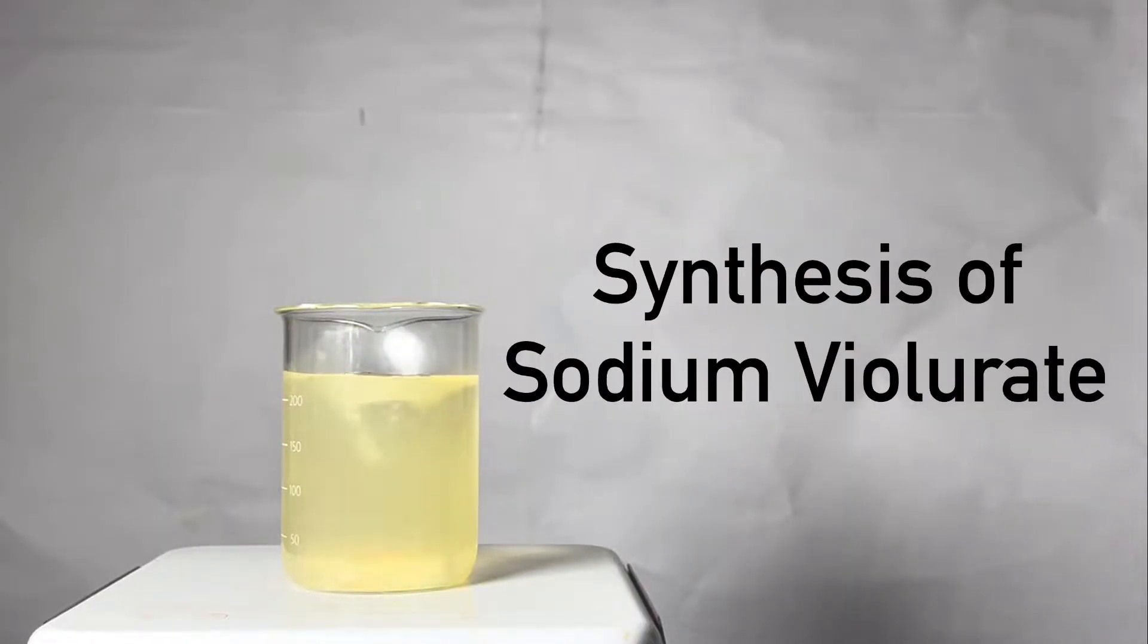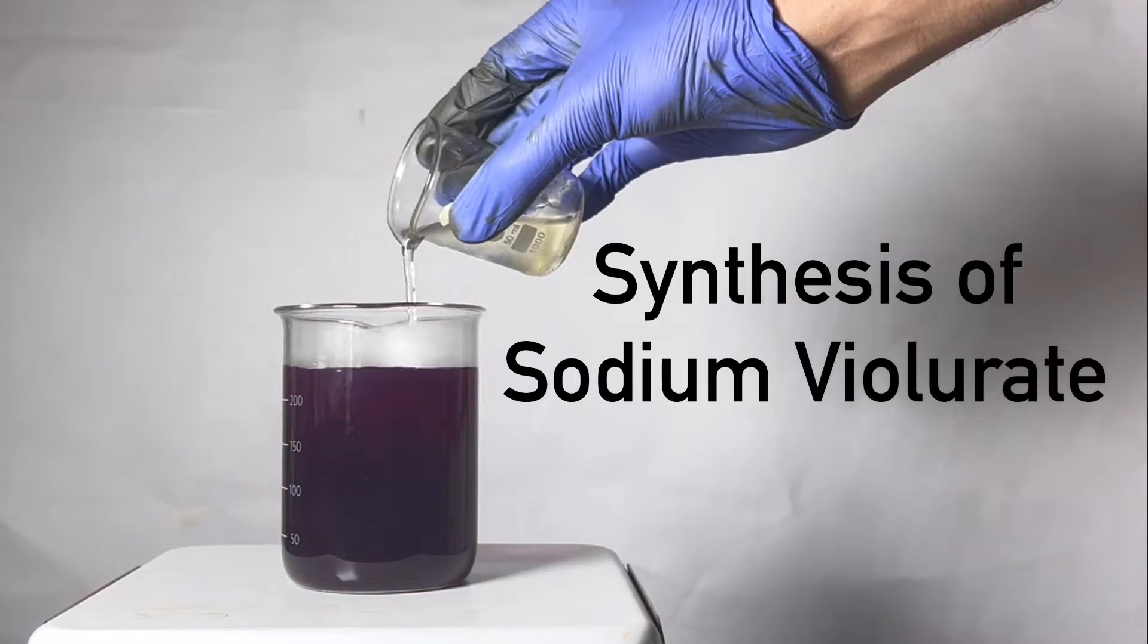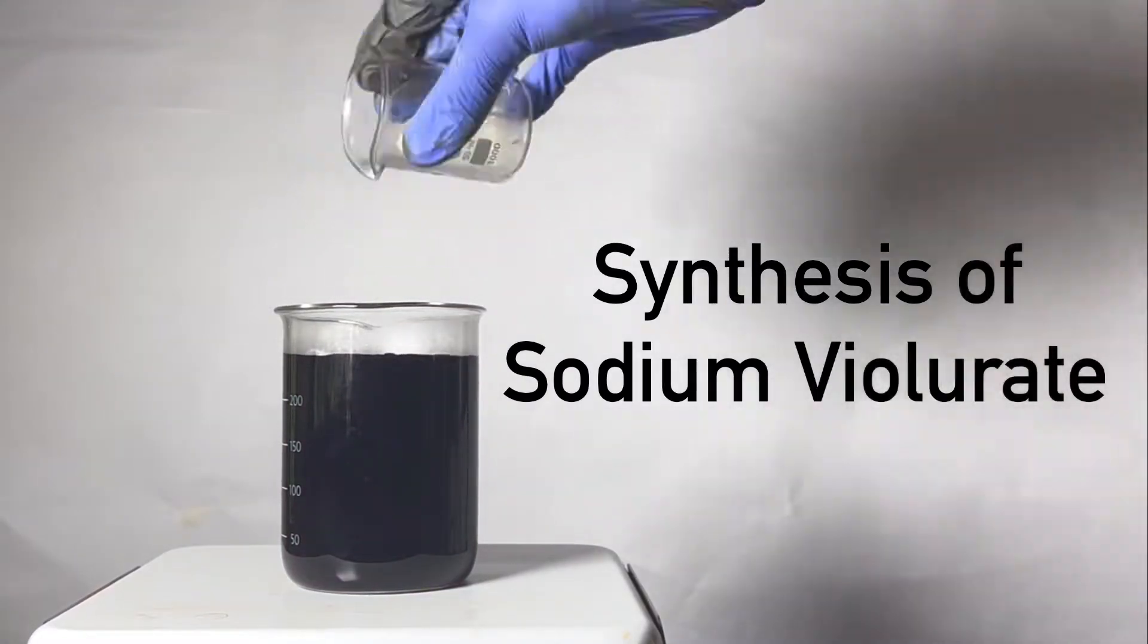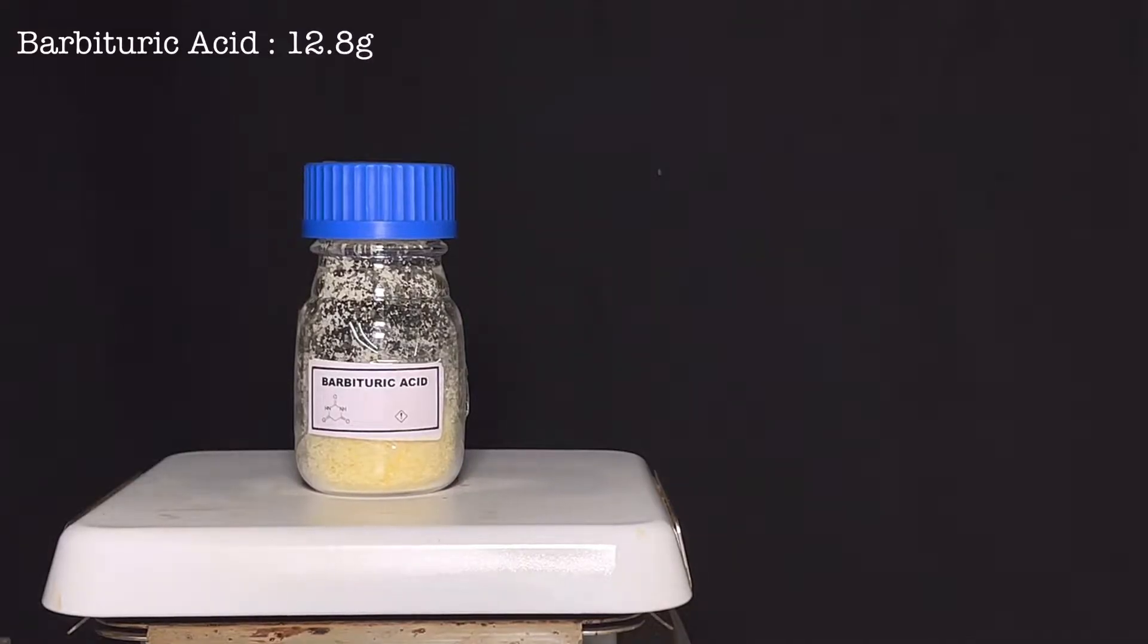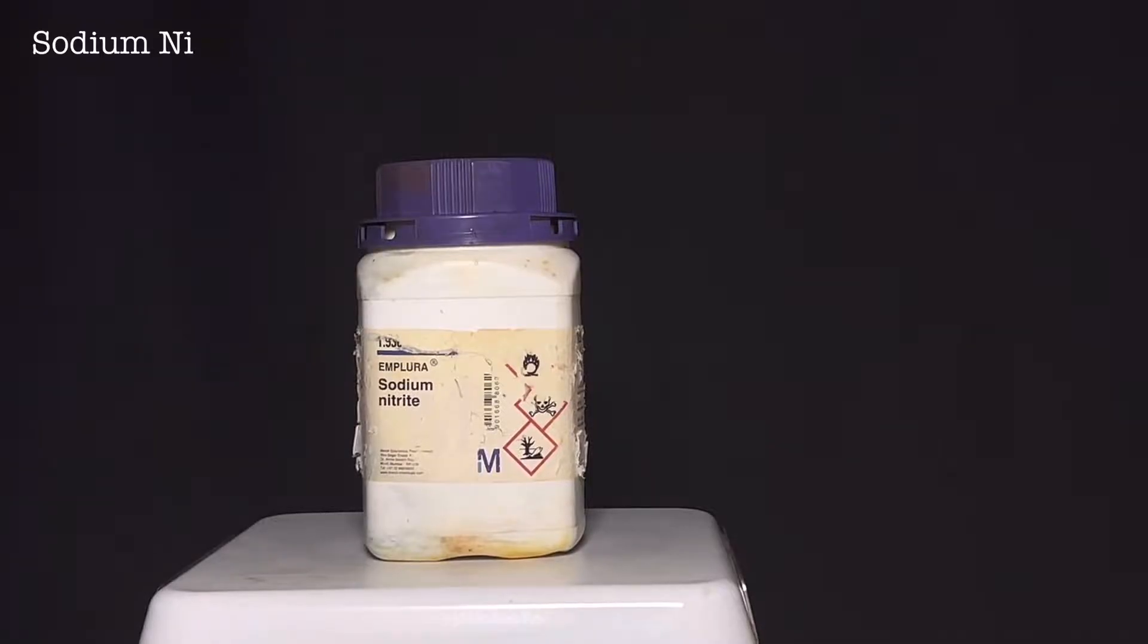Hello friends, in this video we will be synthesizing sodium violurate from barbituric acid. For this synthesis, you will need 12.8 grams of barbituric acid and 7.6 grams of sodium nitrite.